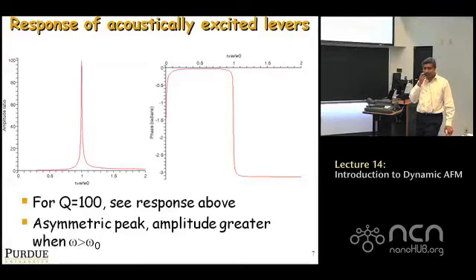How you find out is you do a tuning curve. If the phase goes down like this, it means it's absolute phase. If it goes up across resonance, then it's phase lag that's plotted. Many AFM systems actually plot phase lag.